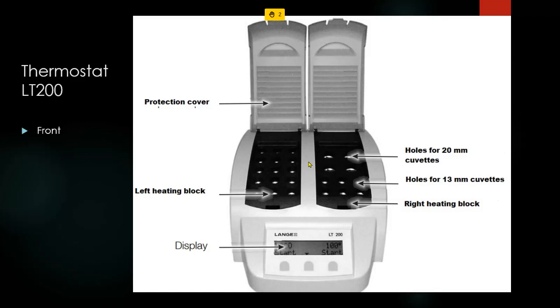Probably you will have the one with only one block. The photograph has two blocks, but probably you have the one with only one block. But it's okay, it's the same. There is a protection cover you can open freely. There is a block. Here there is the display.